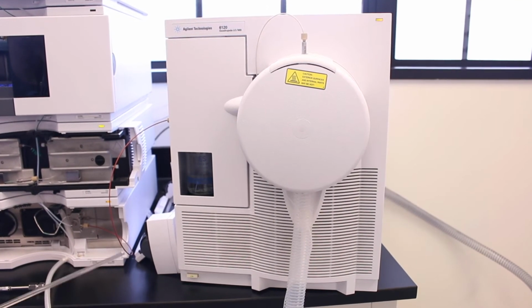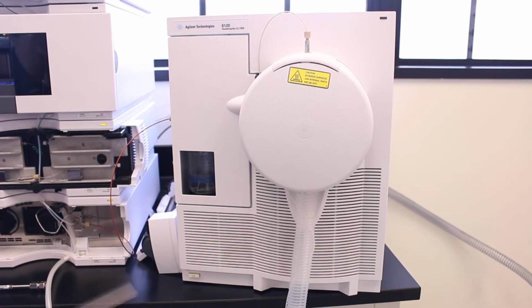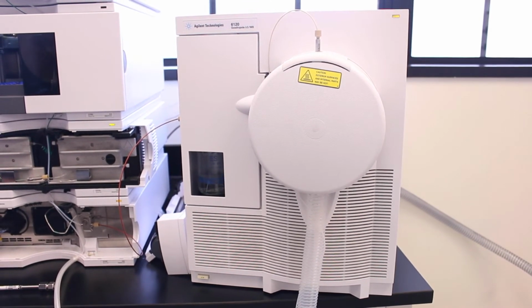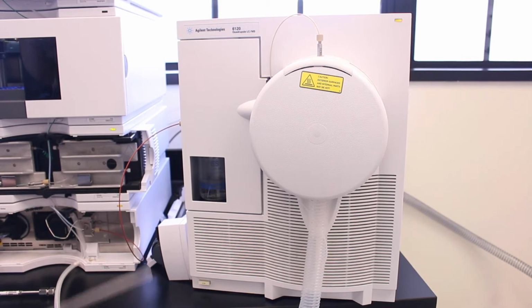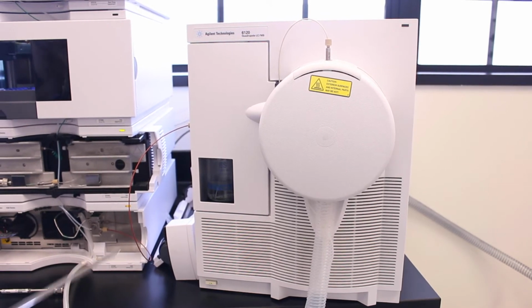The biggest difference between the GCMS mass spectrometer and the LCMS mass spectrometer, at least this mass spectrometer, is that the GC mass spec is a hard ionization technique. It uses what's called electron impact. So that's when the atom is bombarded with electrons. That results in the formation of fragments. So instead of the molecule staying together, some of the molecules are going to be fragmented. So it's not going to be the whole molecule.